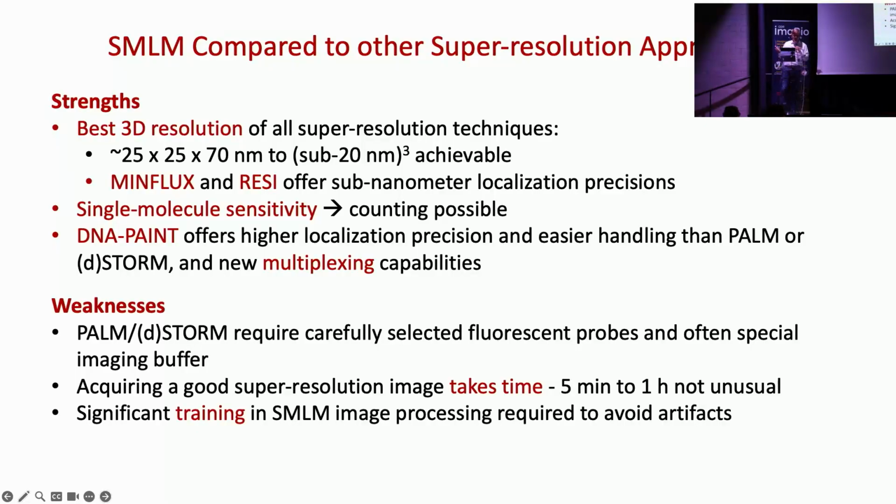And the training on the image processing side should not be neglected. You can easily create artifacts of localizing the wrong molecules if you don't know what you're doing here. But with that, I'm at the end, over my time, and happy to take questions if there's time.